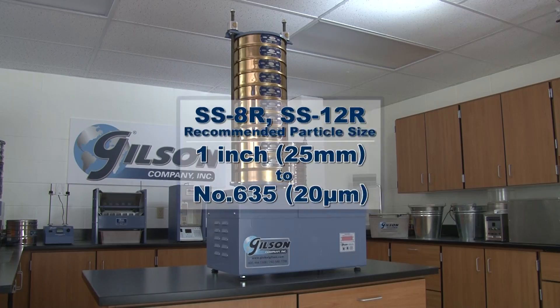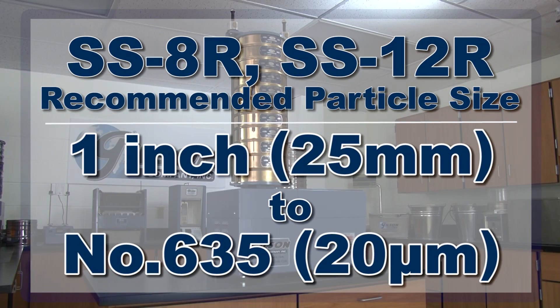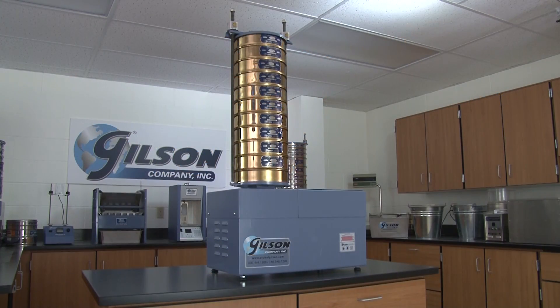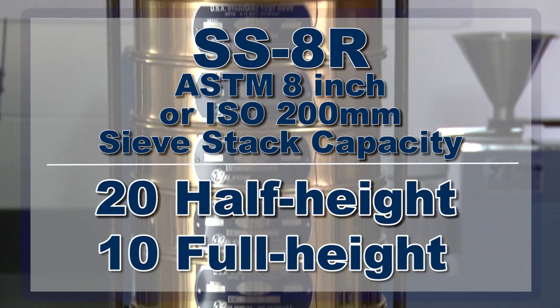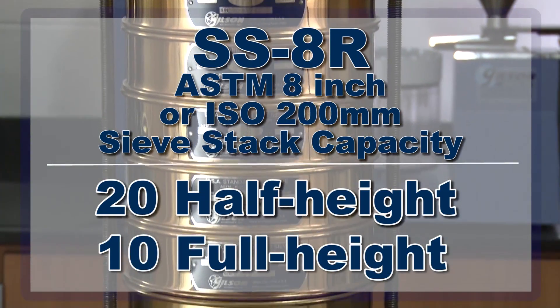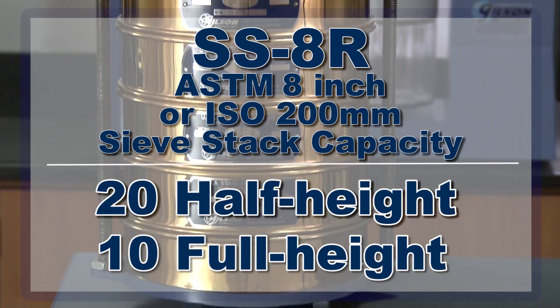With a recommended particle size range from 1 inch to number 635, the Gilson SS8R tapping sieve shaker can hold up to 20 half-height or 10 full-height ASTM 8-inch sieves or ISO 200mm sieves plus a pan.